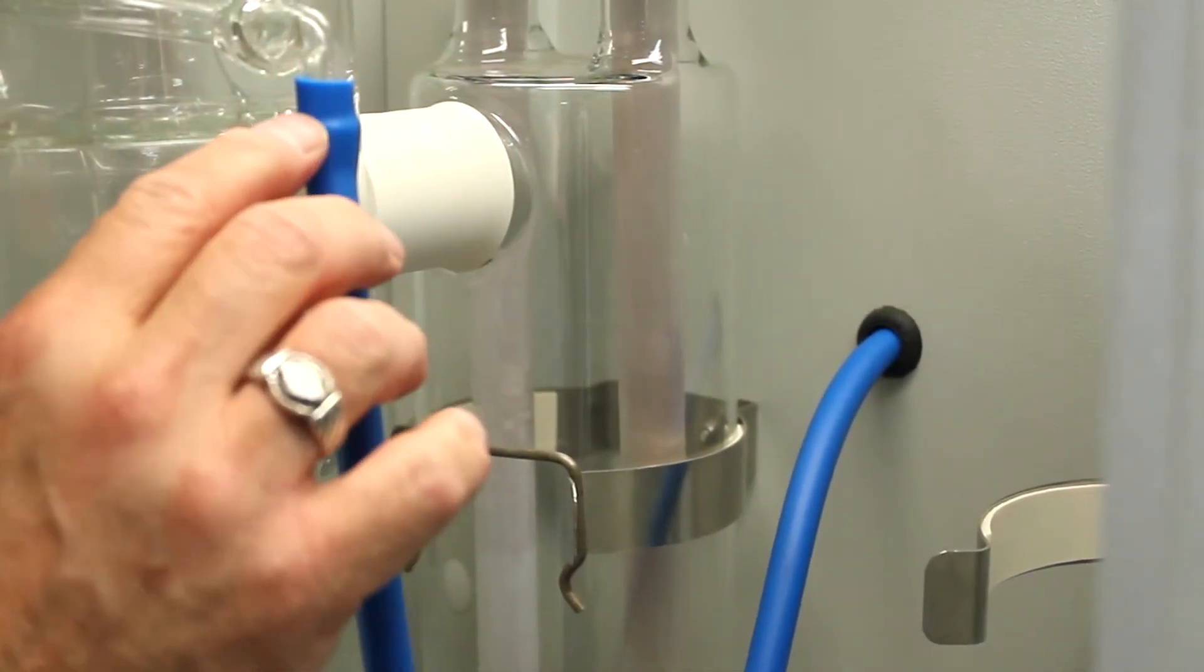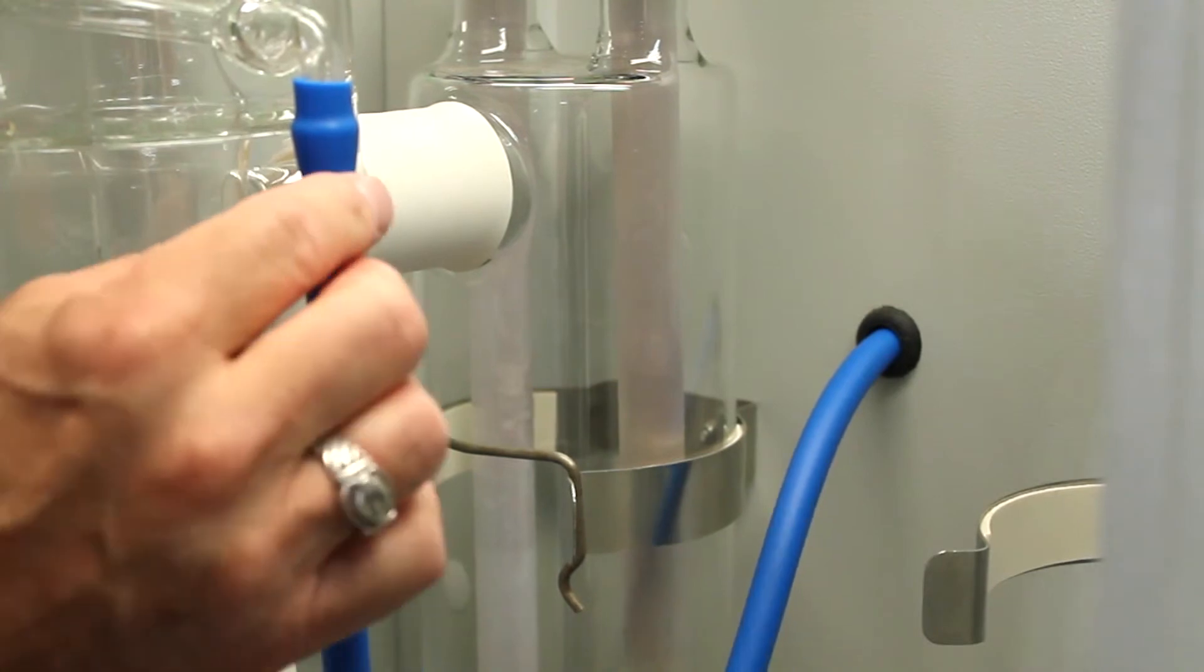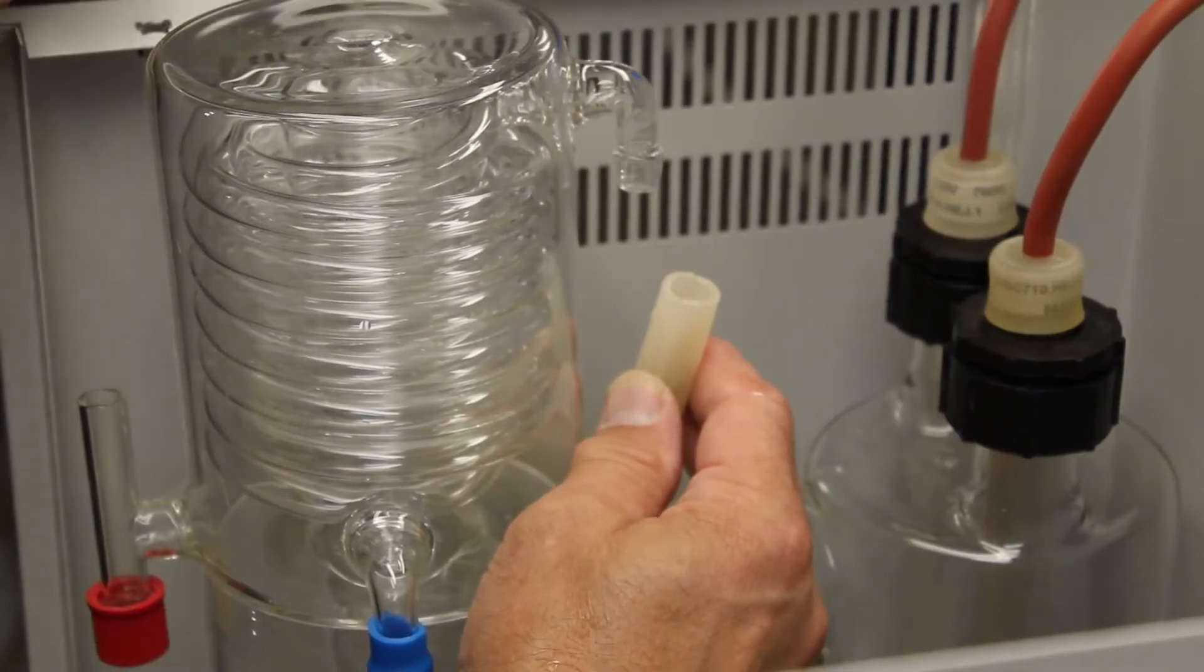Slide the tubing up in there to give it a little bit more ease of installation. Up above the ridge, a little bit, a quarter inch is all you need. That'll definitely hold the tube in place. Now that we have the inlet tubing connected, we're going to connect up the outlet tubing from the condenser.